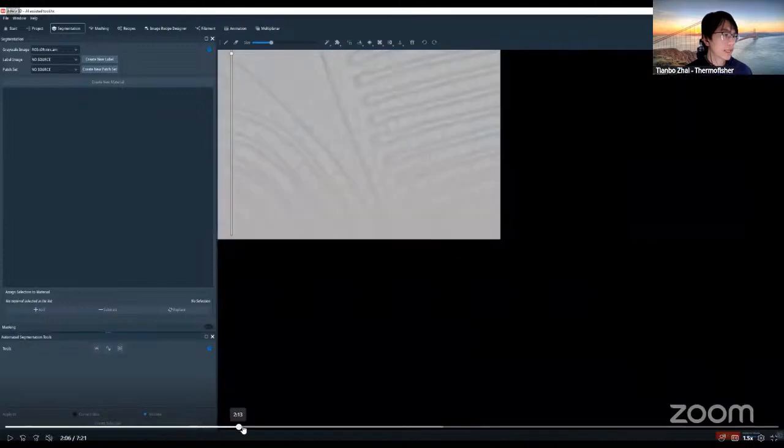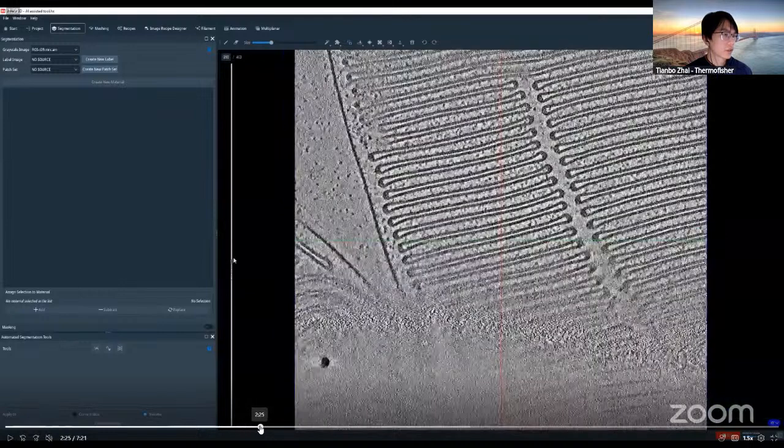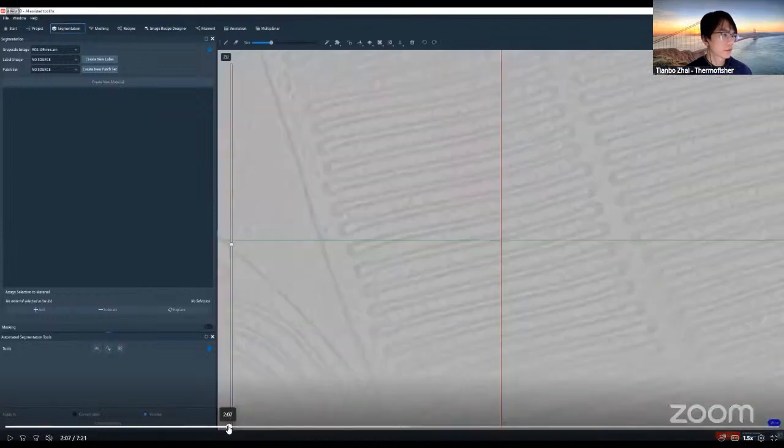As we get started, we want to understand the extent of the image, because as you can see from the other section views, the CryoEM dataset seems to lie in the middle part of the section, where the very top part or the bottom part of the dataset, even though they are acquired, are not necessary. This is going back to the earlier question. Always try to trim down and narrow down to the region of your structure of interest.